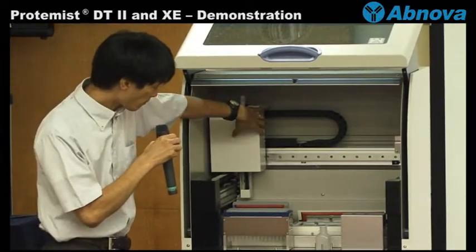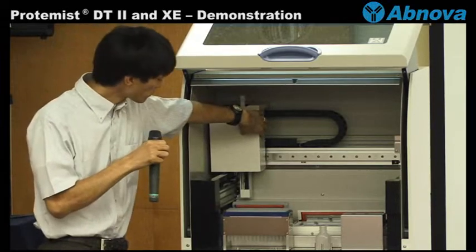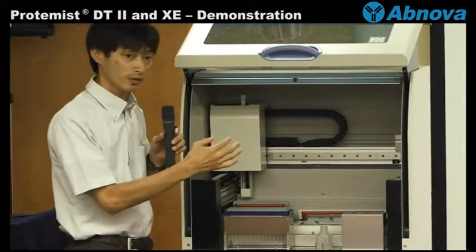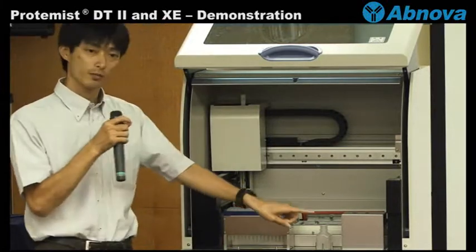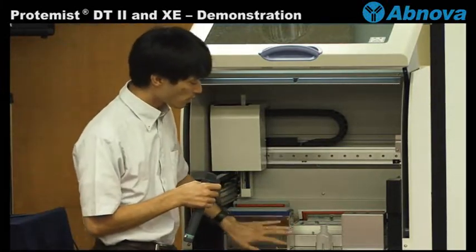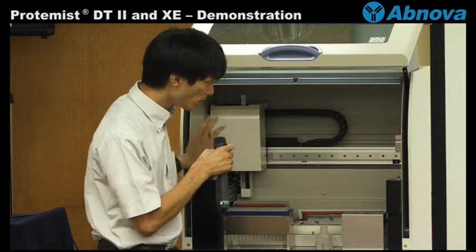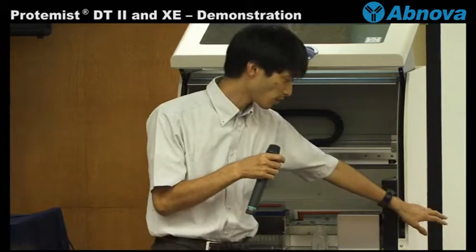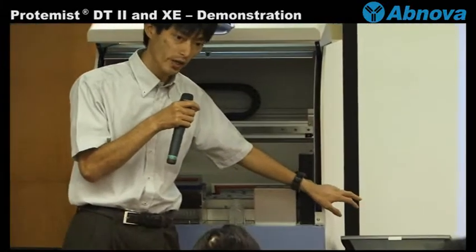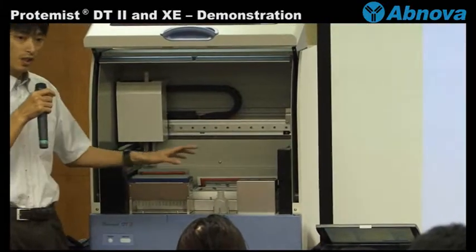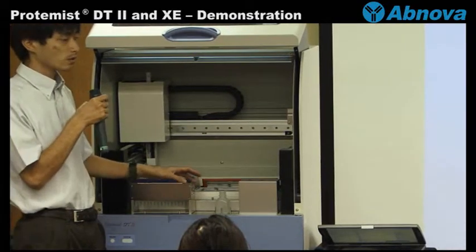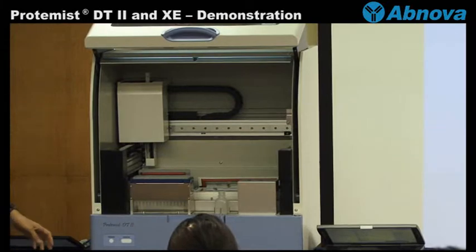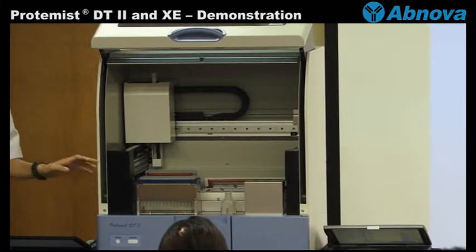And this robot has a dispenser. After set up, all the content of the reagent, push the start button. And this robot is controlled through laptop. Install the dedicated software and the dedicated program. The program is already optimized so that basically we don't need to change each parameter.